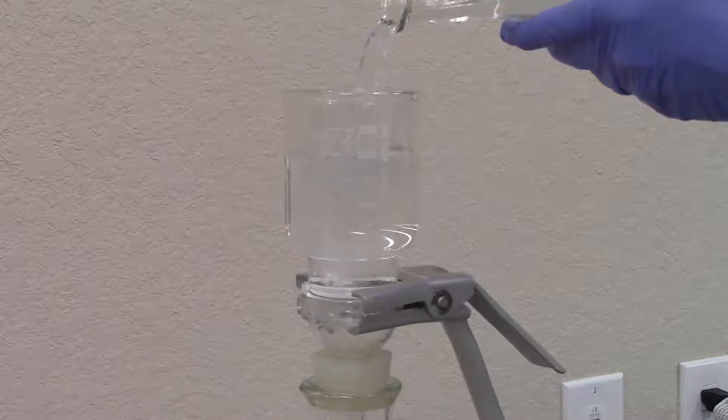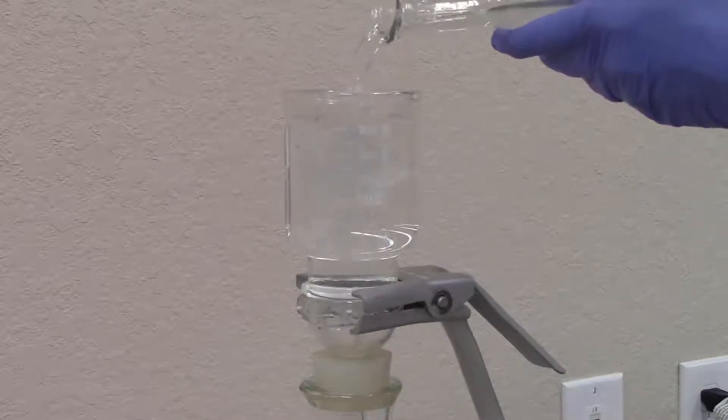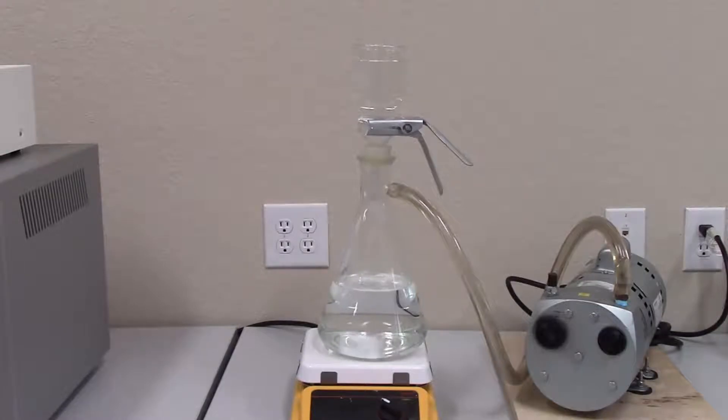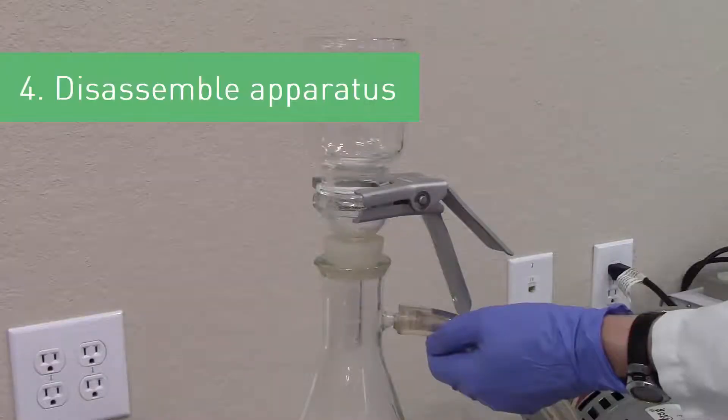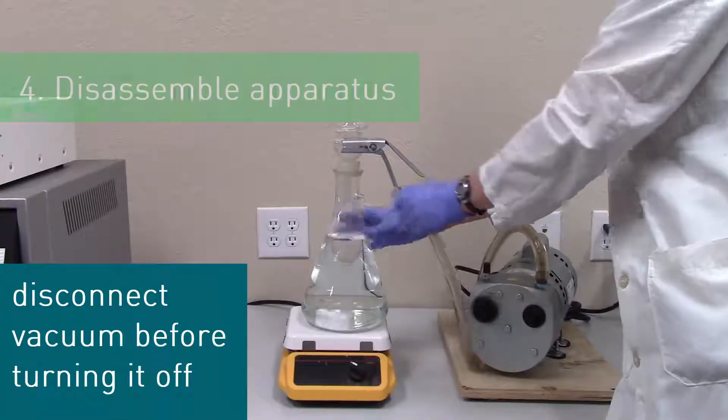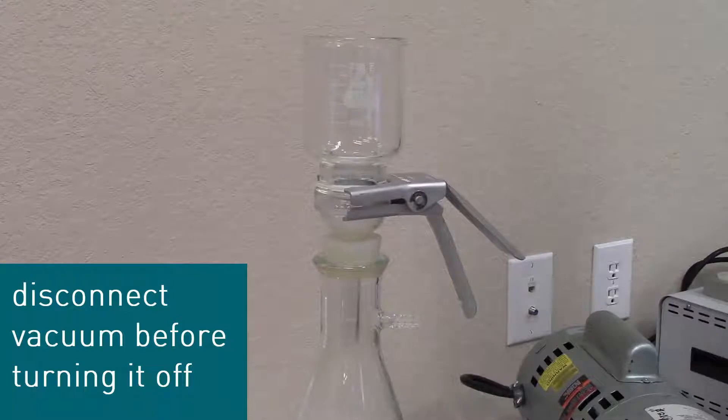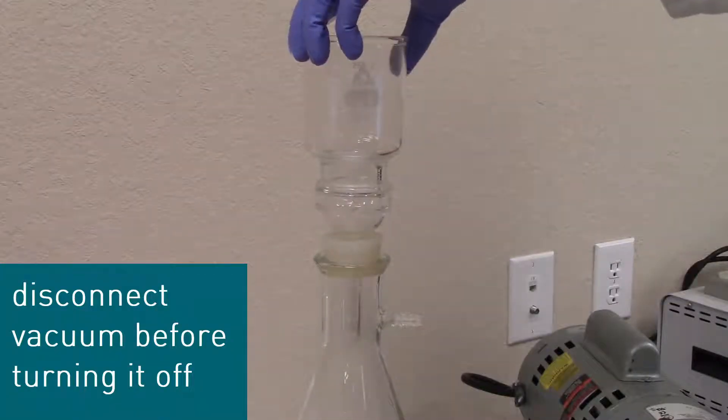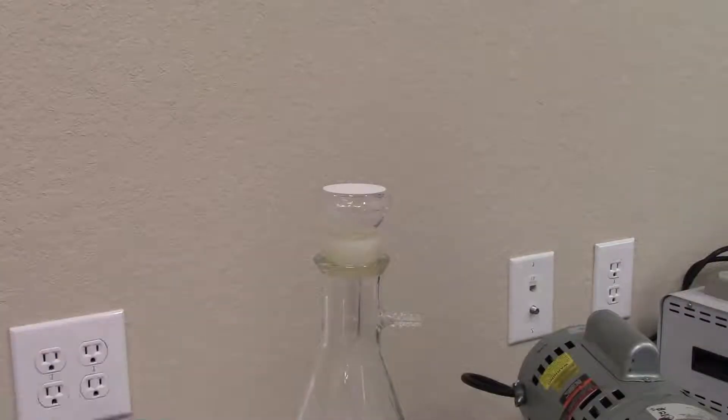Continue to add solution to the filter cup until the entire batch has been filtered. Make sure the stir bar is moving and agitating the filtrate as it accumulates in the flask. Once filtration is complete, disconnect the vacuum hose from the filtration flask and then immediately shut off the vacuum. This prevents anything that may have been sucked into the vacuum hose from contaminating your fresh mobile phase.